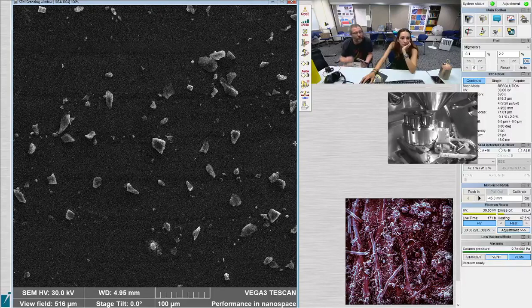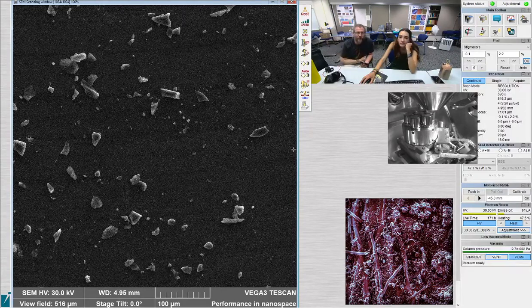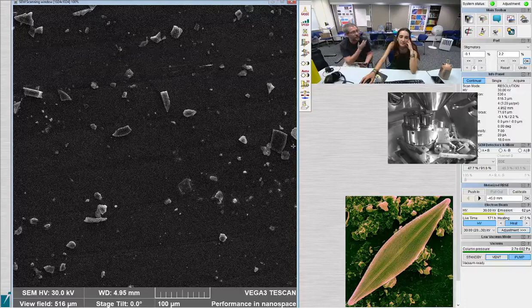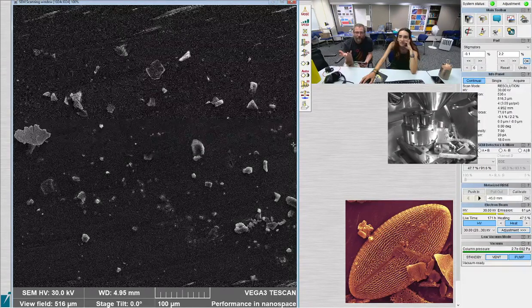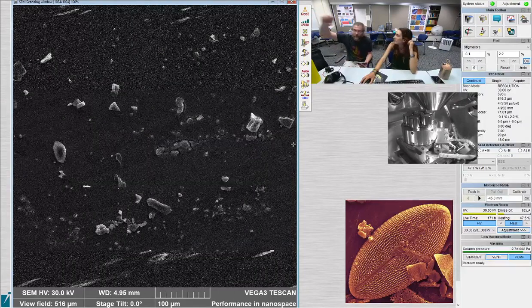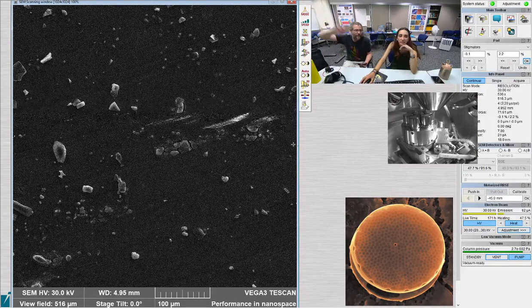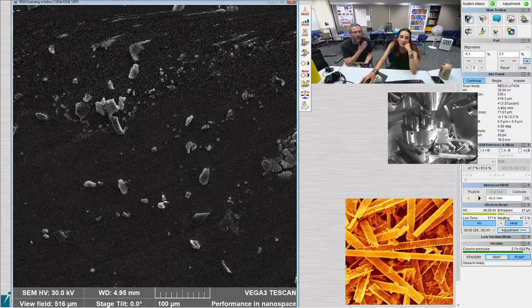What the elemental analyzer does is it uses the normal technique of firing electrons down onto the sample. It knocks electrons out of the material, which is what normally happens, and that's how we get the topography. But then when you knock electrons out of the electron cloud, other electrons have to replace the one that got knocked out. They'll move from a higher electron orbit to a lower one, and when they do, they give off energy, because you're moving from a higher state to a lower state. That energy that's given off is in the form of X-rays, and that's what it detects. Sort of like an XRF thingy.